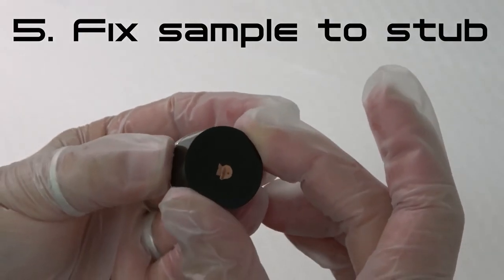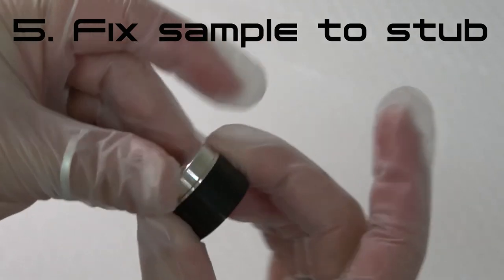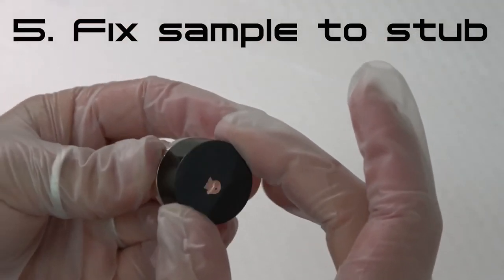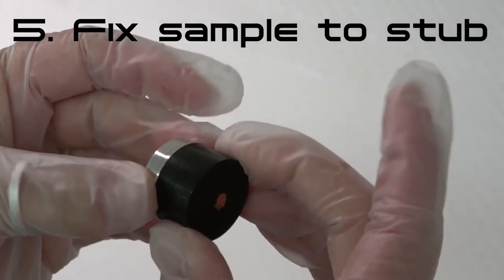Step 5: Center the sample on the stub and adhesive and apply gentle pressure to fix the sample securely. Take care not to damage the surface to be examined or to touch it with bare fingers.